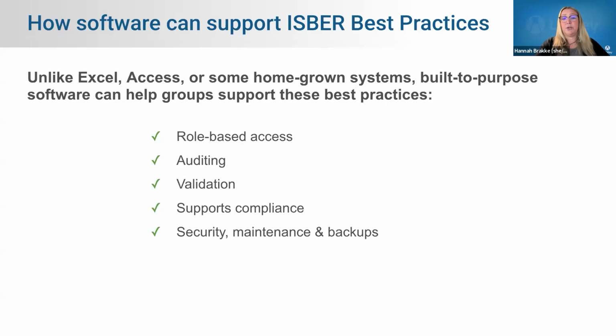And then, crucially, they can be backed by proper security protocols, regular maintenance, and reliable backups. These are the things that are often overlooked in patchwork systems. The result here is not just better software, but also a stronger foundation for quality, reproducibility, and ultimately trust in the data.